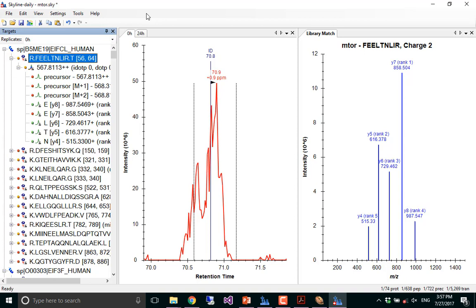Does everyone have data loaded? All right, we're going to set it up so that it actually looks okay. So the first thing that I'm going to do is go to... So this is actually kind of the meat of Pecan. So now we basically just kind of... This is what Skyline would give you as the representation. If you were to navigate this, this would be kind of what Skyline would look like in terms of the peptides that it sees.